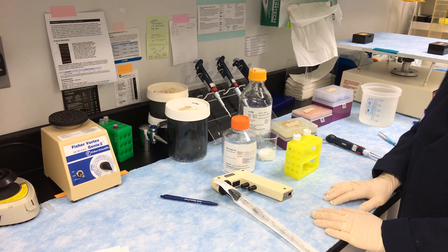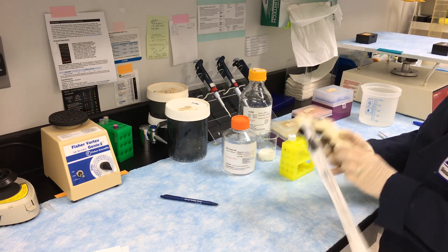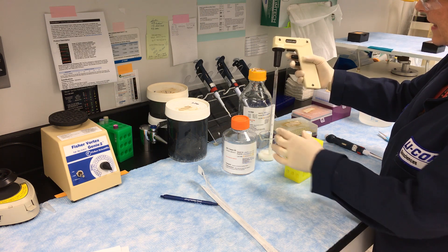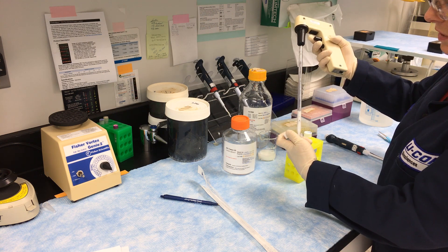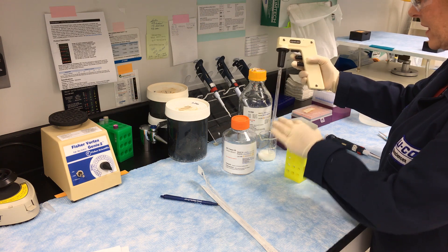While the blocking step is going on, we're going to go ahead and make up our tubes for the antibody dilutions. We'll make one for primary and one for secondary. For this size of box, we're going to use five mils, so I'm going to put five mils of milk in each one. This is 5% milk in PBS.